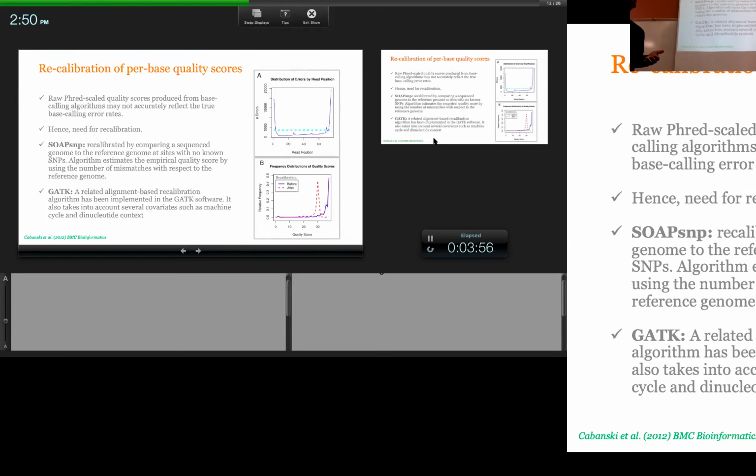It's going to say it's not good, even though your reference genome is the problematic one. We also said, if that's a true SNP in your sample, which is what you're looking for in the first place, recalibration is going to penalize you for finding a SNP. Does that make sense?